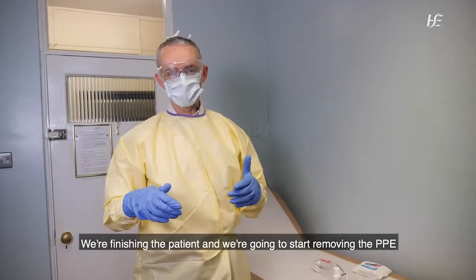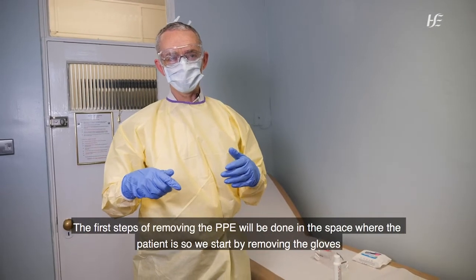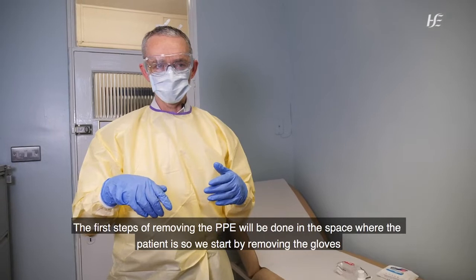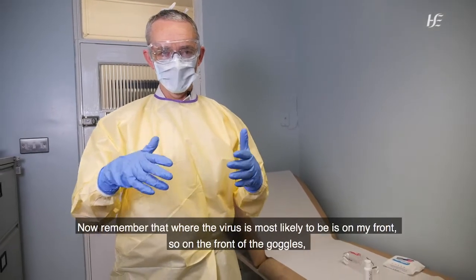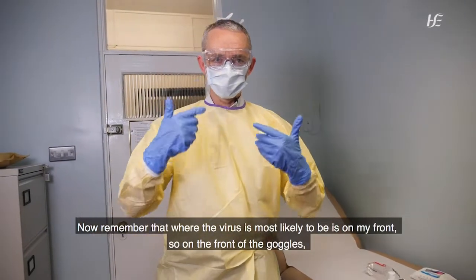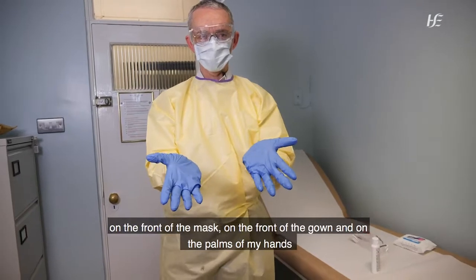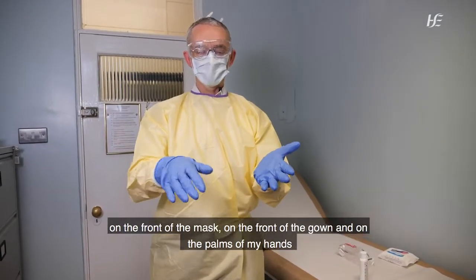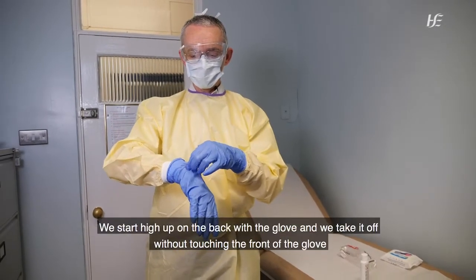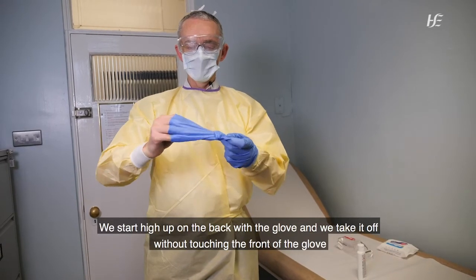We're finishing with the patient and we're going to start removing the PPE. The first steps of removing the PPE will be done in the space where the patient is. So we start by removing the gloves. Now remember that where the virus is most likely to be is on my front. So on the front of the goggles, on the front of the mask, on the front of the gown, and on the palms of my hands. So the technique is about trying to avoid contact with those areas. So we start high up on the back with the glove, and we take it off without touching the front of the glove.